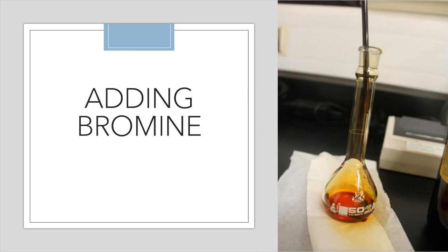Now here's the thing with acetic acid. Acetic acid does a very good job of capturing bromine and keeping it in solution so it doesn't turn into a vapor, but some of it's still going to do that. But acetic acid is going to help me out a little bit, and it's needed for the reaction anyway. We need this to be acidic conditions. So acetic acid, bromine, somewhat match made in heaven, but bromine's still going to escape if I'm not fast about this addition.